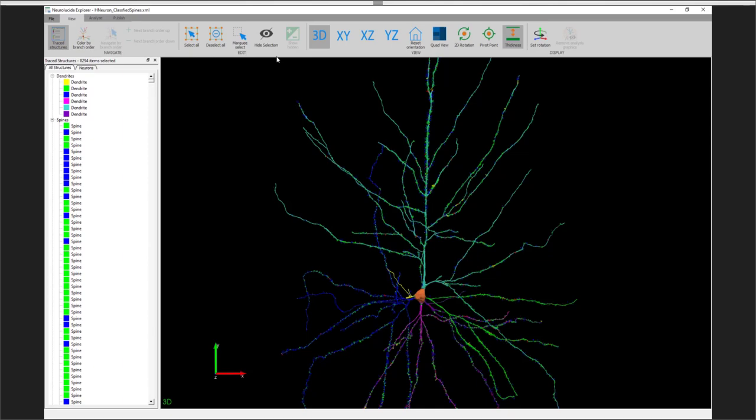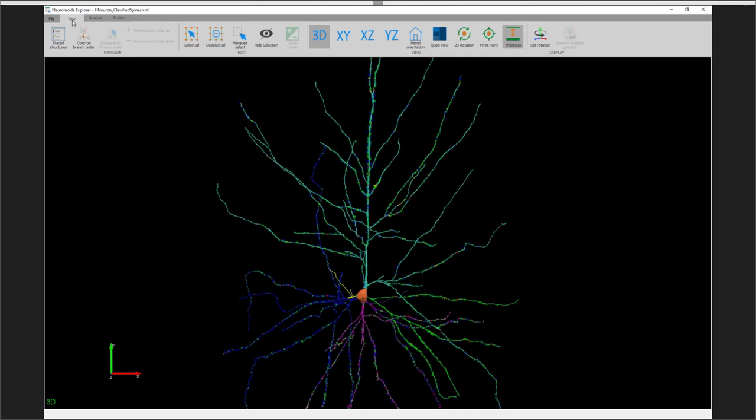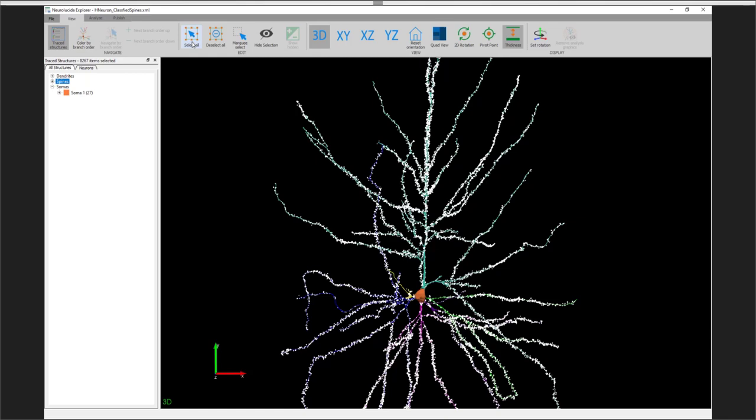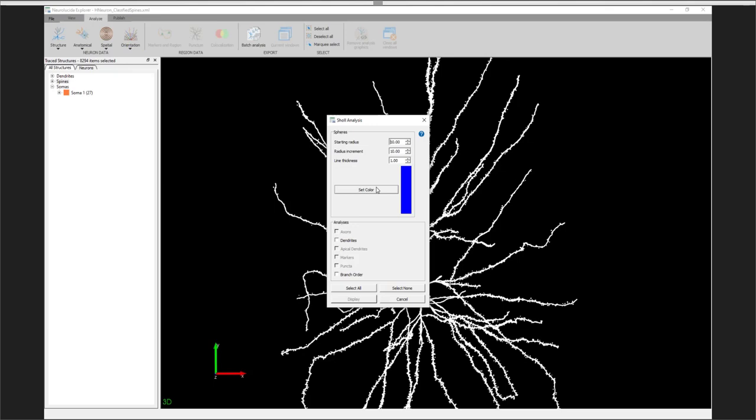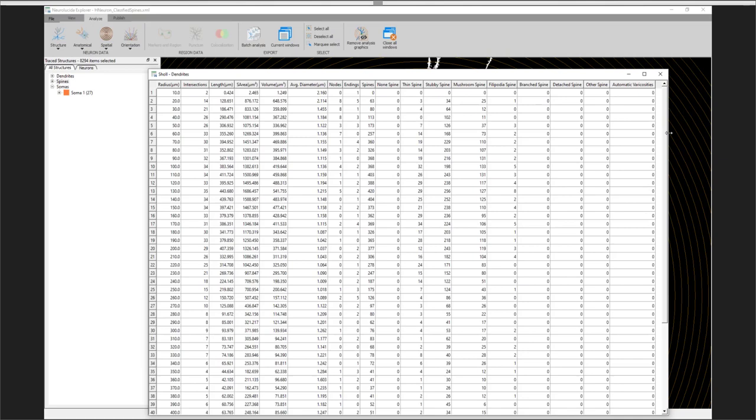So we can use this select all button, or we can use the trace structures tab here on the left side. That's going to be made available under this view tab, and then trace structures. So selecting all of our objects, I'm going to select all right here, and then I'm going to go to analyze, spatial, and Scholl analysis. I'm going to change the color here to orange, so it's a little bit easier to distinguish than that dark blue. And then I'm going to keep these settings the same at the default. From here, I can click display, and we'll get a number of columns and rows.